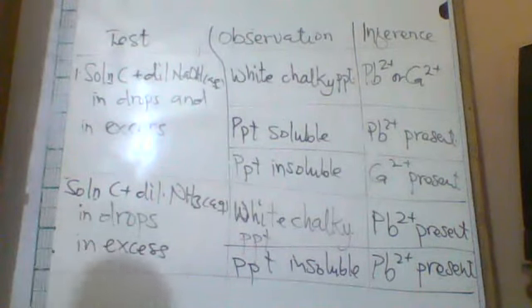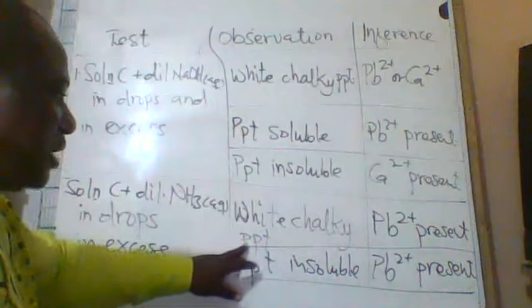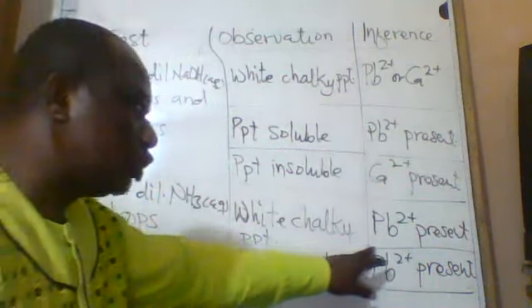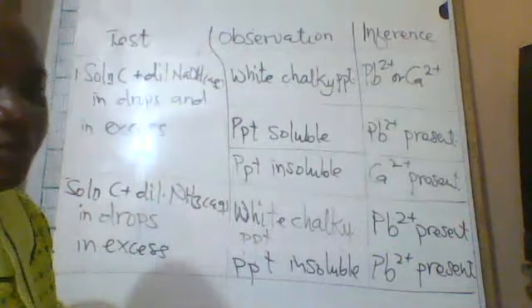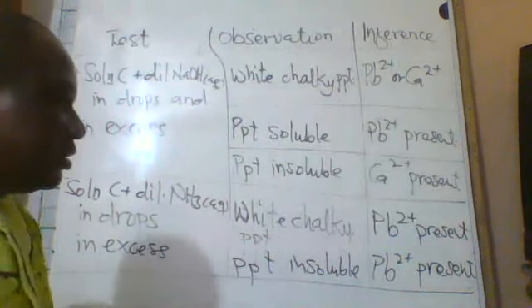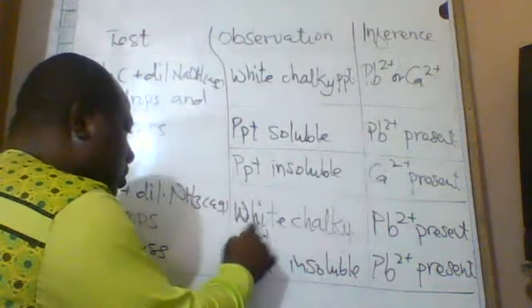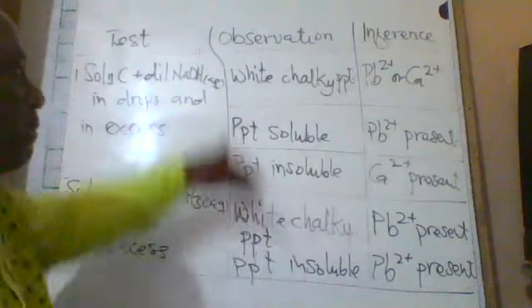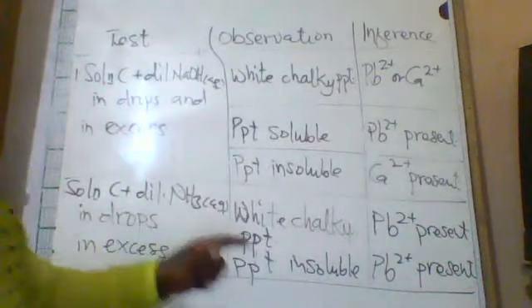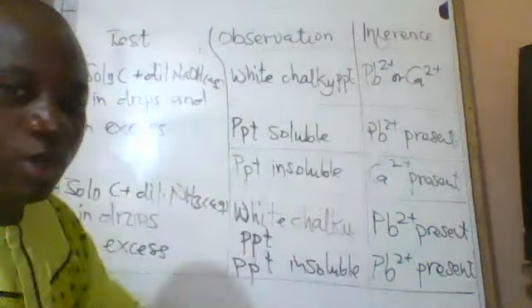So that one will not be able to precipitate the calcium. So the calcium will not give you any PPT. There'll be no observable reaction. You will not see anything. The solution will just be there like that. That means that it is calcium. And even before you get to the addition of ammonia, you know which ion is there.